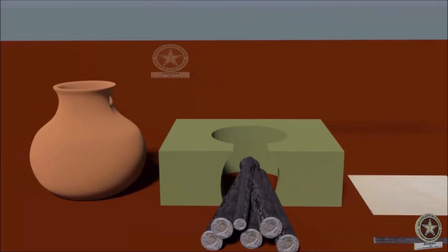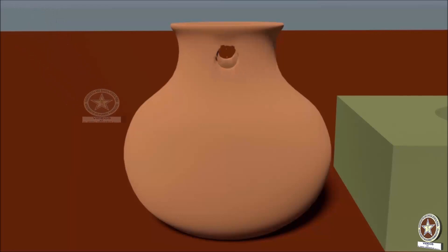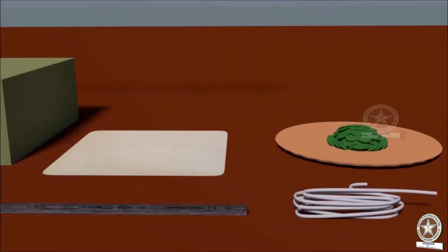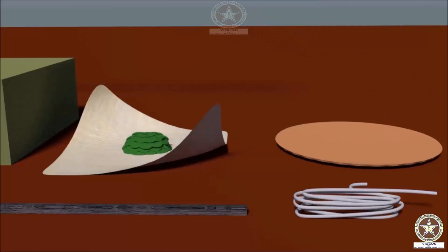To begin with the procedure, a bhanda or pot is taken and holes are made at the neck on either side. Next, the Shodhana Dravya — that is Kupilu here — is placed in the cloth and tied into a bundle or potali.